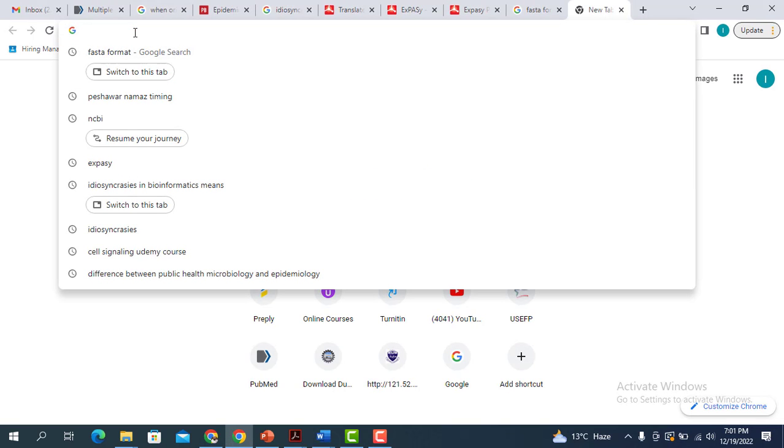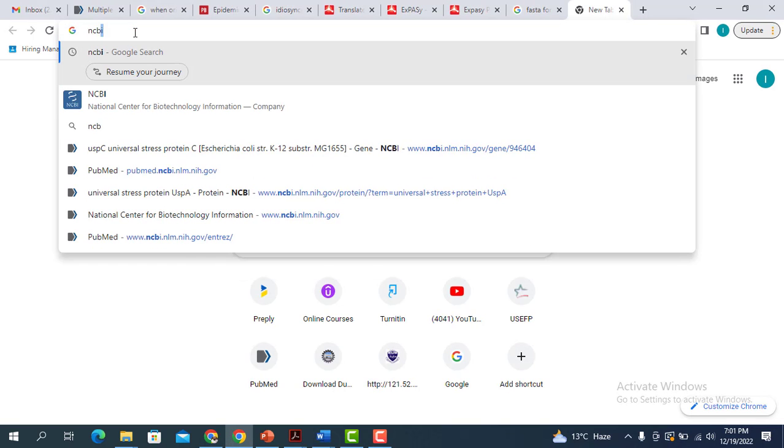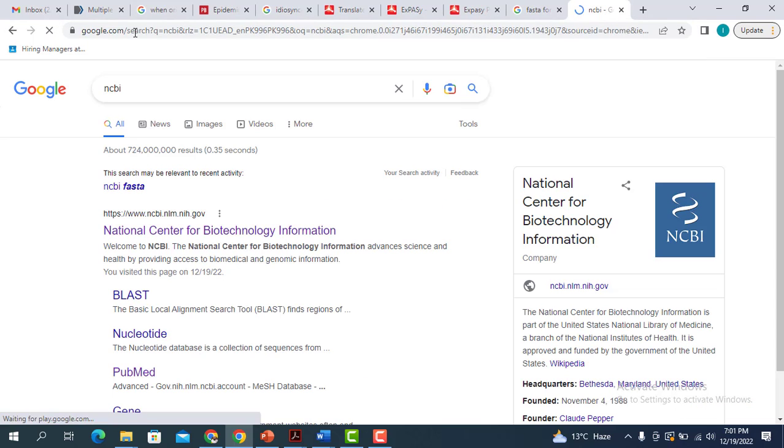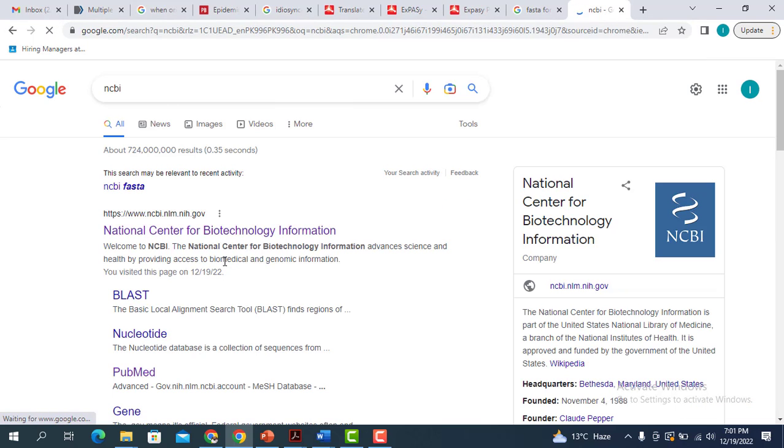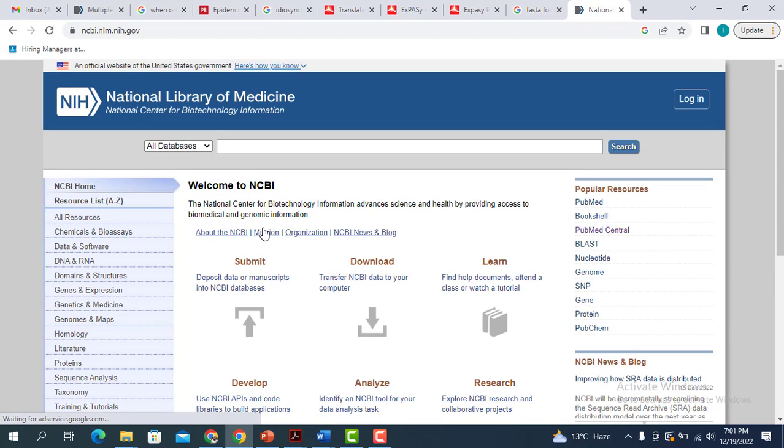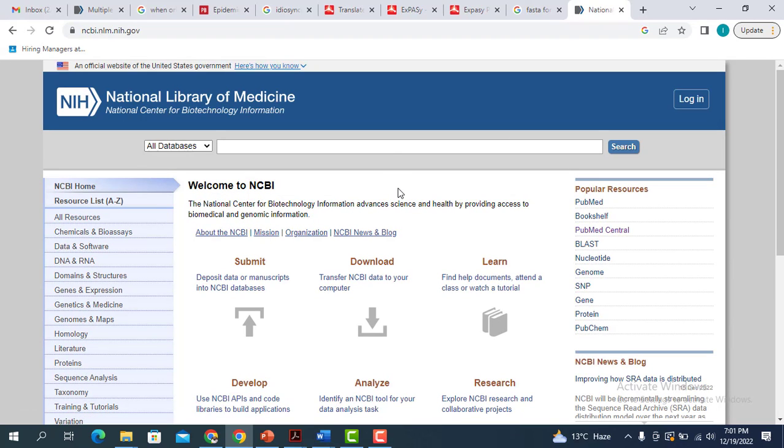The first thing you have to do is go to the home page of the NCBI, which is the National Center for Biotechnology Information. When you click this, it will lead you to this particular page.